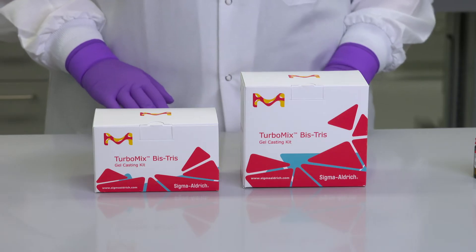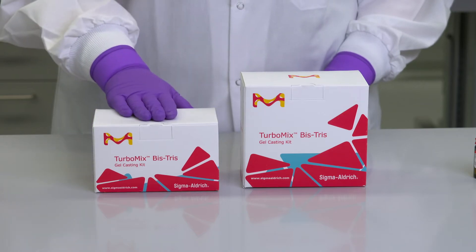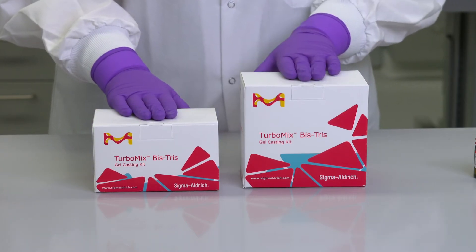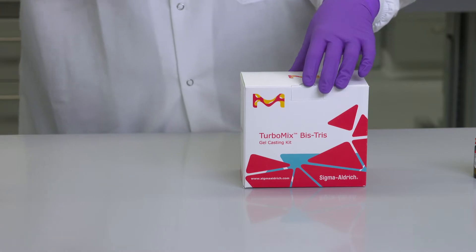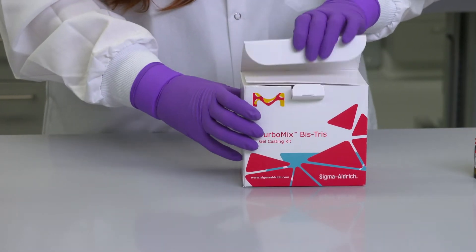The TurboMix BisTris Gel Casting Kit comes in two different sizes, enough to make 10 gels or 60 gels. This kit has been optimized to simplify gel preparation steps and minimize reagent waste.